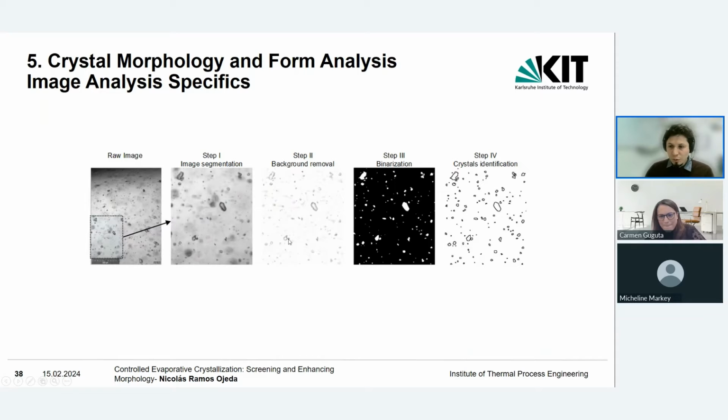Then for all those small segments, you had the background removal, the binarization, and after that the perimeter of the crystals is constructed, and then with a circumscribed ellipse you had the X max, I mean the length and the width of the crystal. Yeah, the same is exactly the same in version 3.